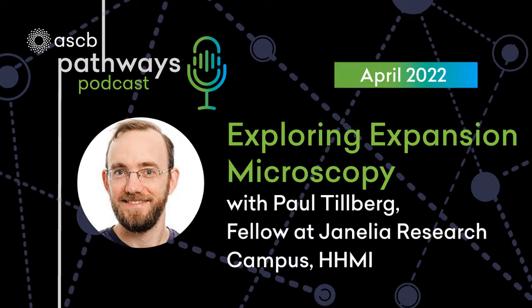And by doing that, you get phase separation, not at the macroscopic scale, but at the molecular or say 10 nanometer scale. And so what happens is that you can generate very elaborate nanoscale structures with ordering over micron or macro scale lengths. So that's probably the most relevant part of that experience for the later development of expansion.